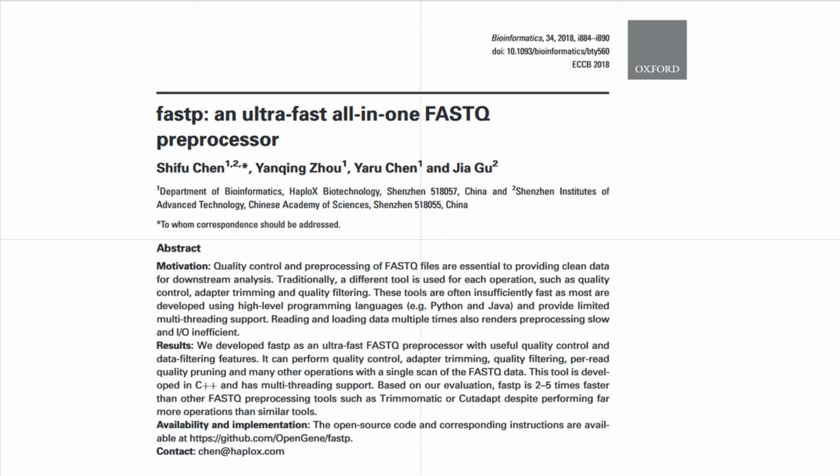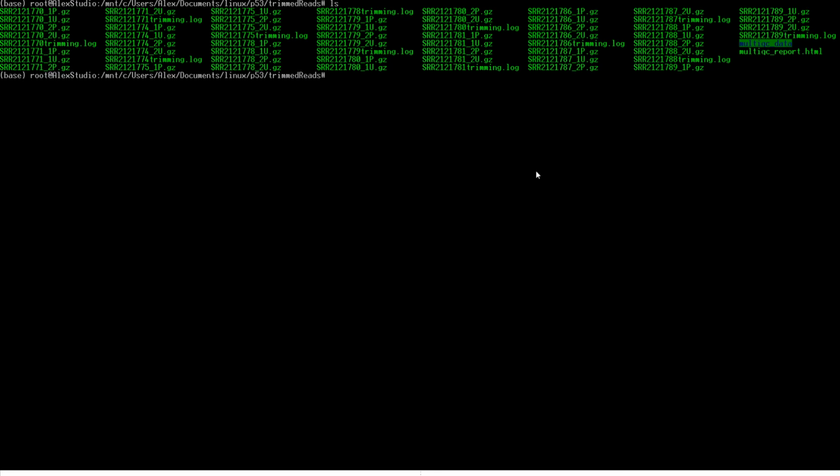From there, we can go over to the Ubuntu window. So we're actually in our Ubuntu window now, and if we do ls, we'll get a list of everything in here. You can see that I already have our MultiQC output, but we can remove those. We'll just remove multi. It's a directory. Oh, it's a folder. That's okay. Anyway, so we're in this folder. We can see we have all of these logs, and I'll just go through and delete it over here then if it's not going to like that.